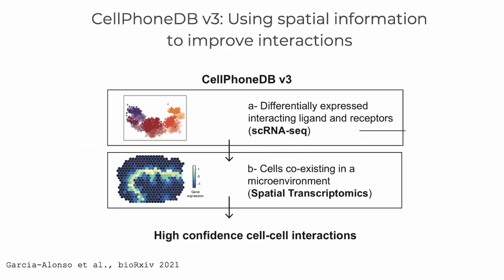So moving forward, in our team we are continuing to develop CellPhoneDB, and we have recently integrated these predictions with spatial transcriptomics data, where we consider that cells that are in the same microenvironment give us the opportunity to improve our interactions.